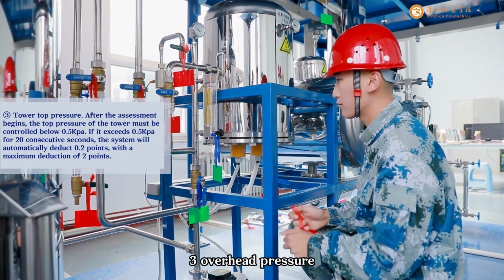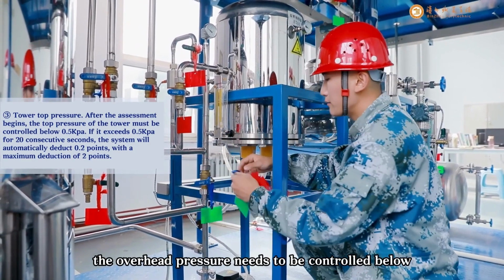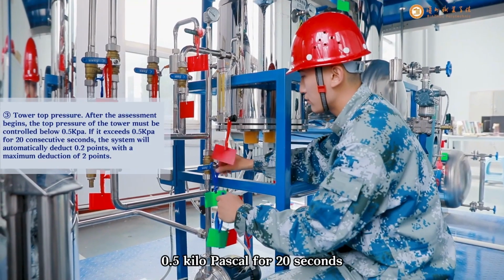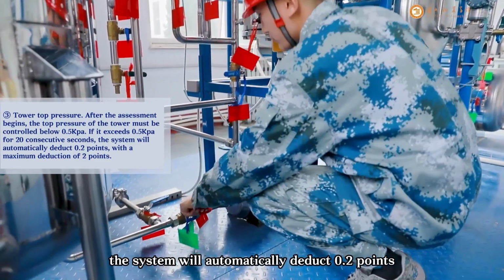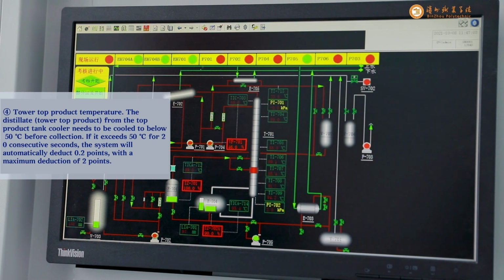3. Overhead pressure. After the assessment starts, the overhead pressure needs to be controlled below 0.5 kilopascal. If it continuously exceeds 0.5 kilopascals for 20 seconds, the system will automatically deduct 0.2 points, with a maximum deduction not exceeding 2 points.